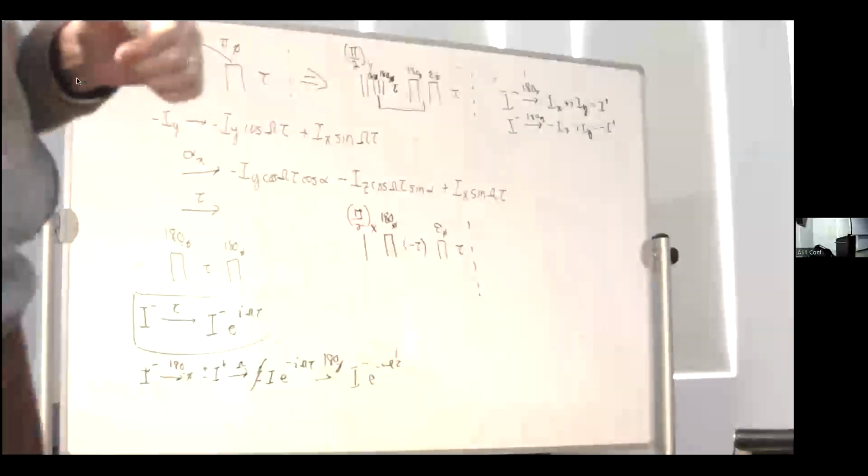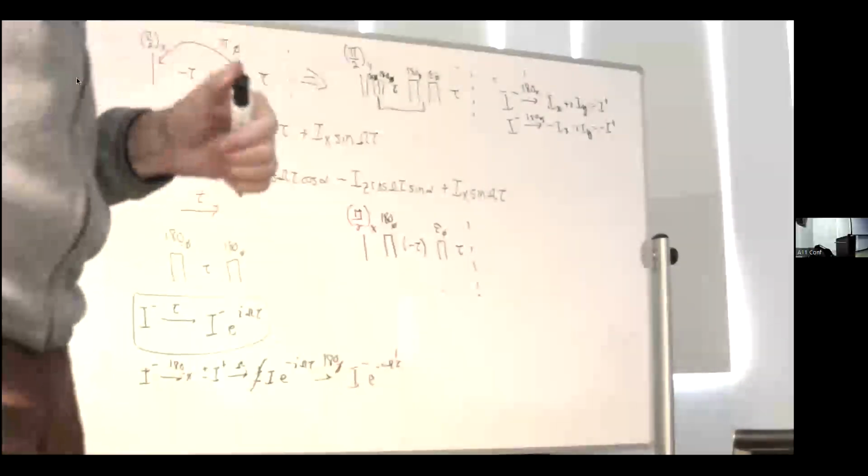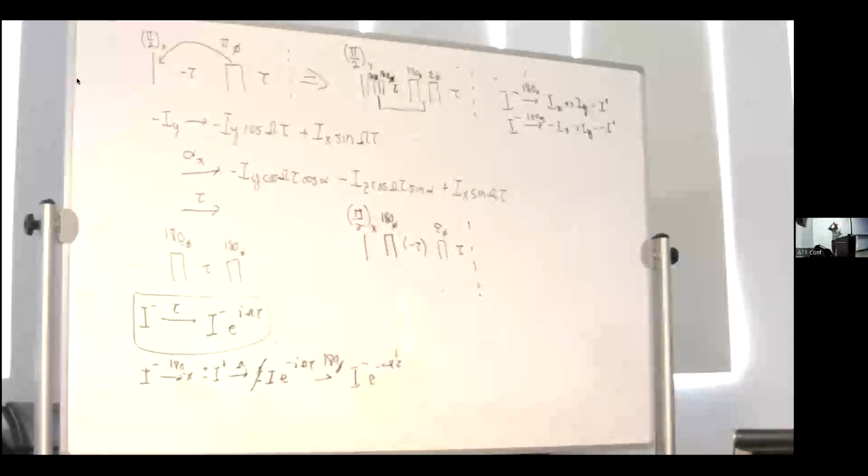So something called sweeping 180-degree pulses. You sweep them all to the edge. So with that, I'll let you work on this and see what happens.